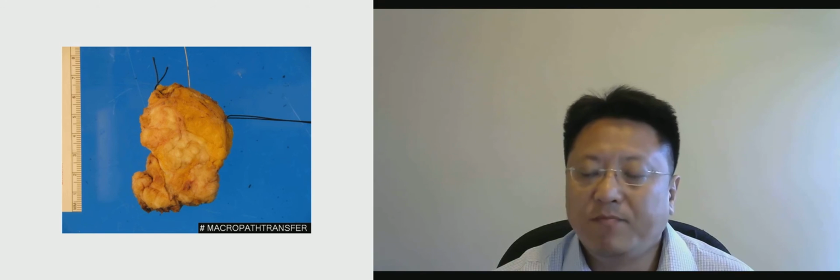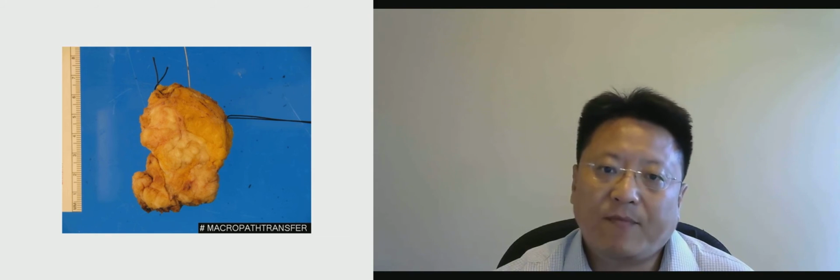Here's a lumpectomy specimen we get from the surgeon. This is just a part of the breast tissue. The surgeon will use sutures to orient the specimen so that we know which margin is which, which is very important for the surgeon and for patient care. Usually the surgeon will put a short stitch indicating the superior margin and a long stitch indicating the lateral margin.